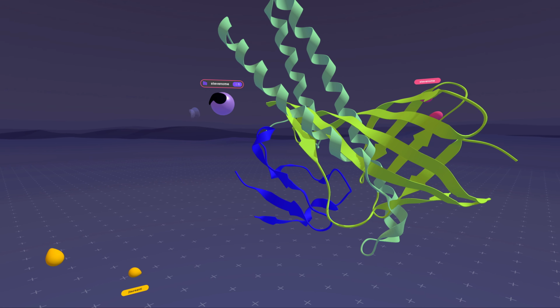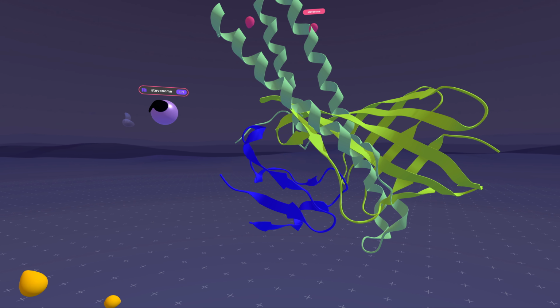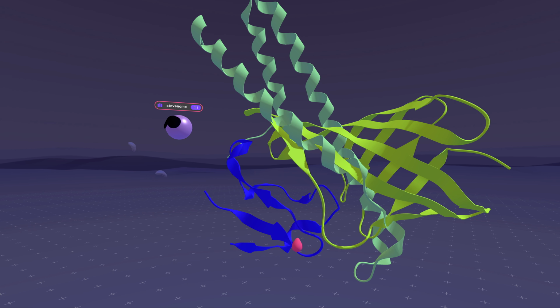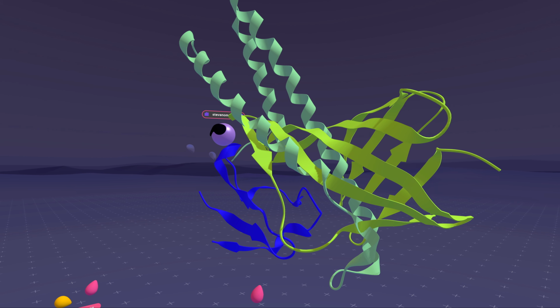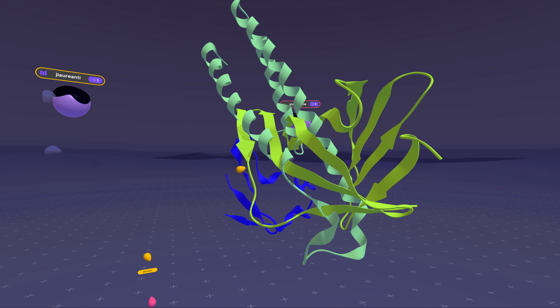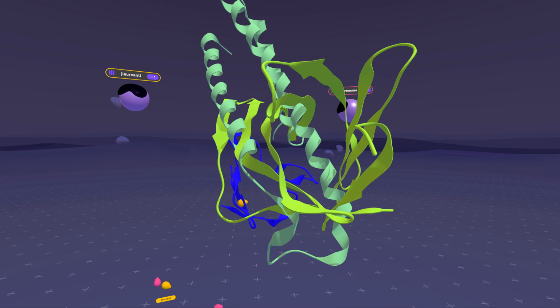You have this huge beta sheet barrel, and then you have this little alpha helices triple coil over here. But theoretically, they're both binding to the same protein. So similar actions, even though they have very, very different structures. Yeah, and that's why I actually wanted to do this today. They're literally the opposites of each other.